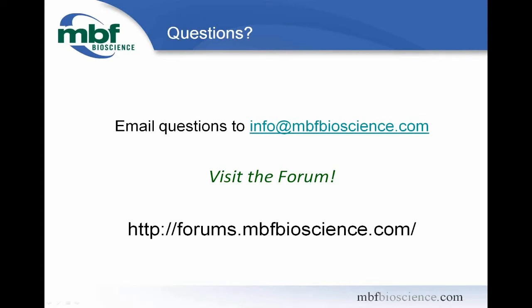Carlos asks a good question. Does the DAT file contain enough information that you would not need to define a lens on an offline system? Actually, Carlos, the information regarding the lens is on a separate file. It's a lens file, and we would recommend using the same lens information on a different workstation. So you would have to use a workstation that has the same lens file.